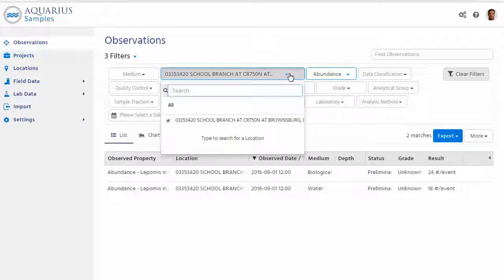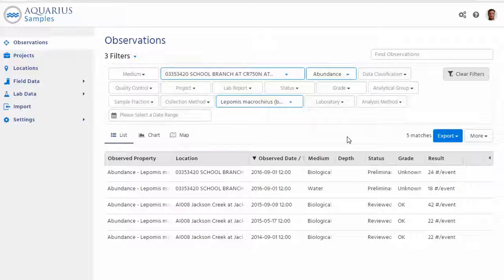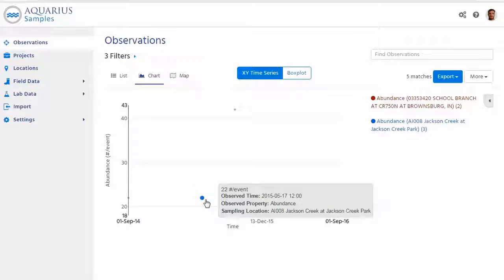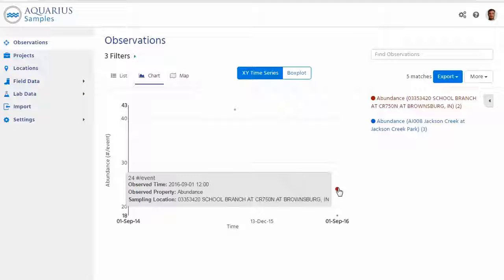And I'm actually going to add a little bit more data from one of our demo sites I happen to know has more of this. So yeah, what can I do with this data now? I think the obvious selection is just throw it into a chart. This way, without any manual work, I can get a real quick visual representation of the abundance of a specific species over time across different locations. So that really makes that data very accessible and allows you to drill into it without going into spreadsheets and manually having to work with it.